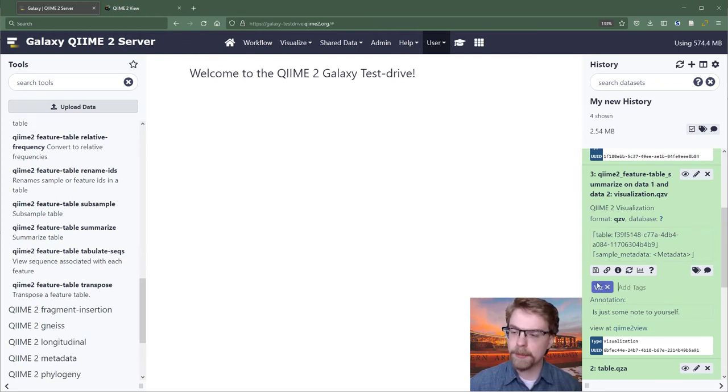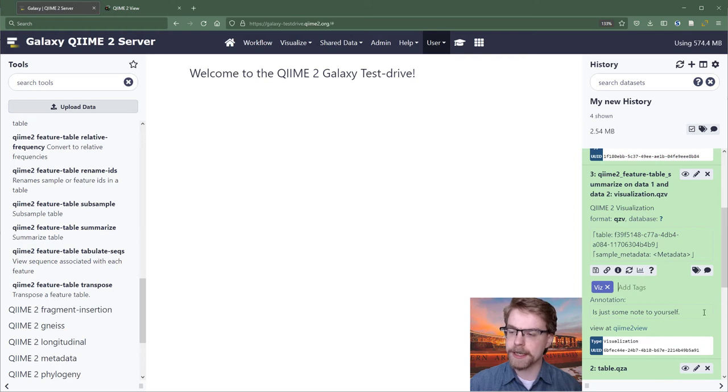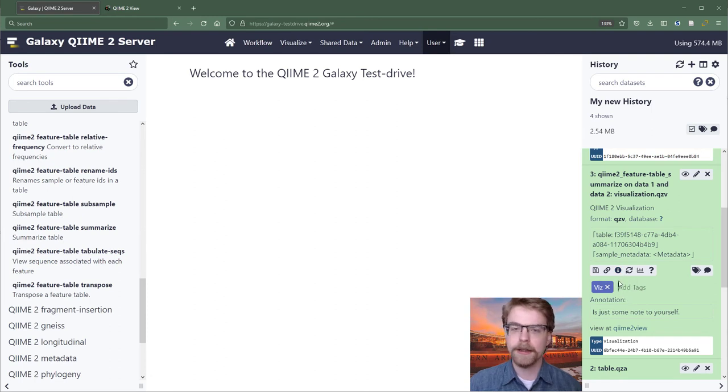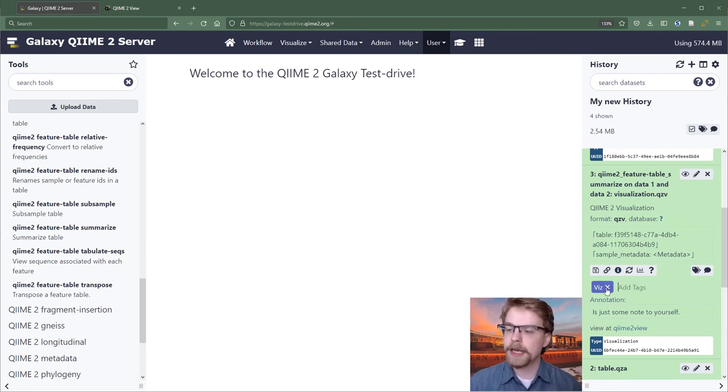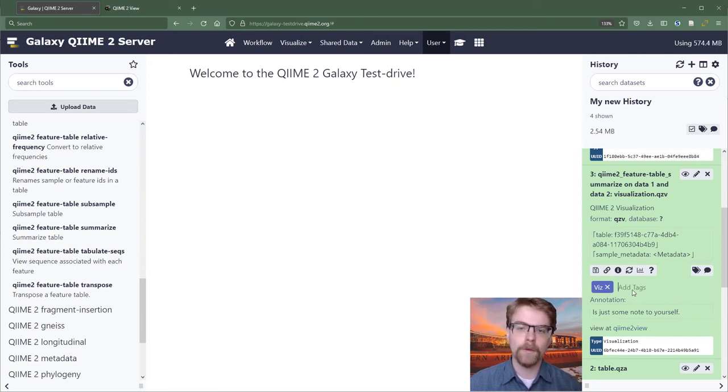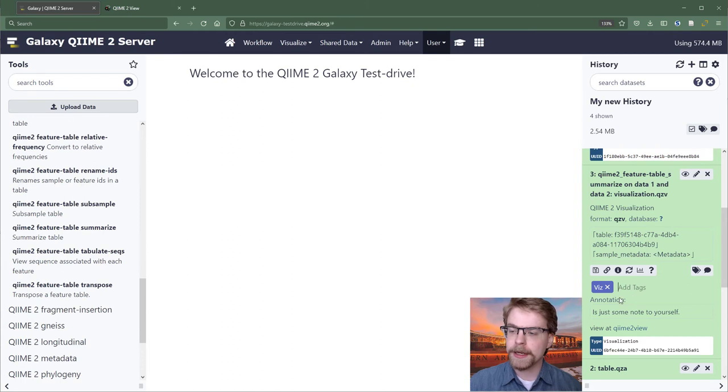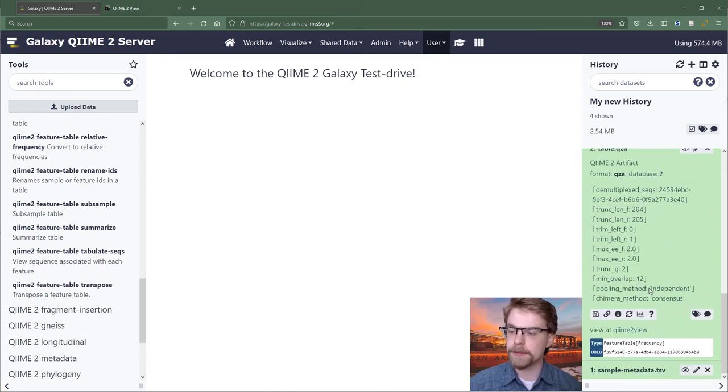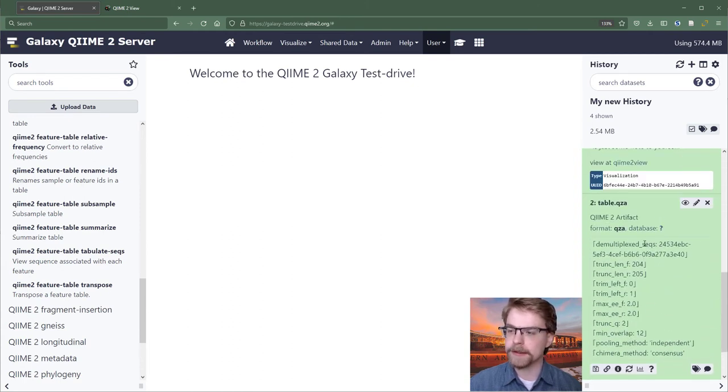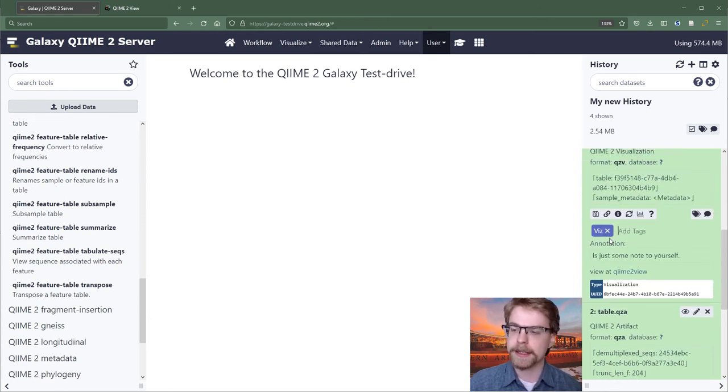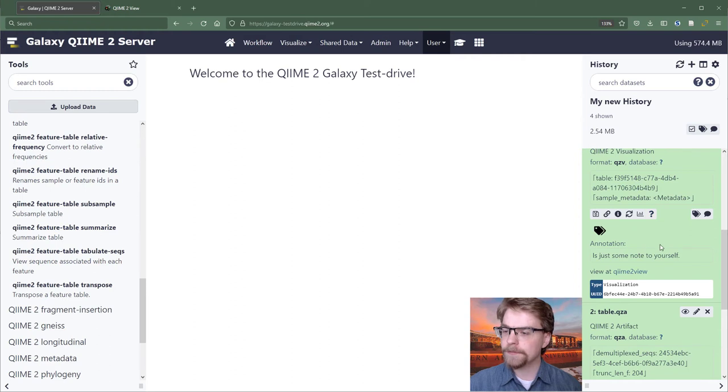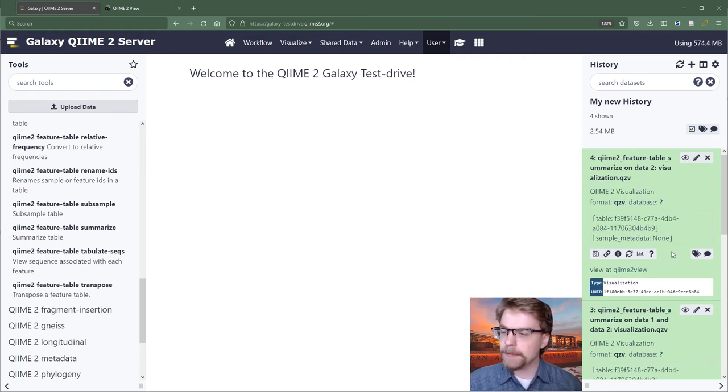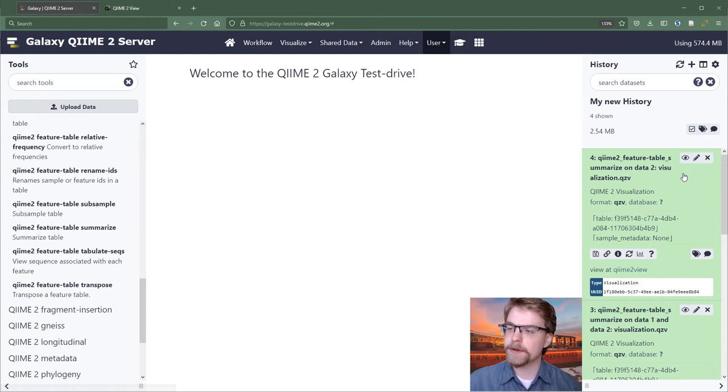This is not super useful for QIIME 2 necessarily, but it's very helpful in some other Galaxy workflows where a lot of sample management is handled through tags. Because what will happen is these tags will basically stick together as you start running through analyses. And you'll accumulate tags based on upstream processing. So if you have a tag per sample, suddenly it's very easy to tell what samples were used in some result. Now in QIIME 2, we keep all of our samples within basically one artifact. So this isn't super interesting. But I want to point it out as a feature that Galaxy has. You can also remove the tag.